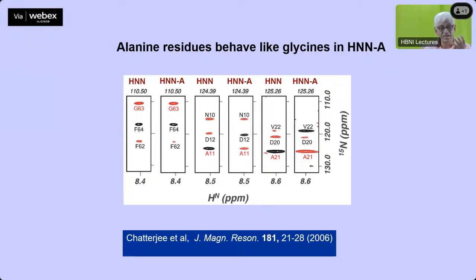Therefore you create a three-dimensional spectrum with the N15 chemical shifts on two axes and the NH proton chemical shifts on one axis. Two particular experiments we considered, the so-called HNN and HNCN, have different magnetization transfer pathways. And we also showed how these can be analyzed.